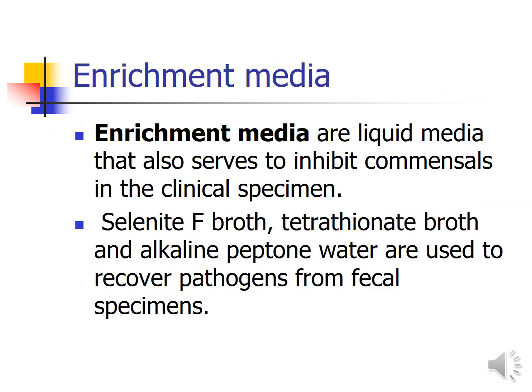Next is enrichment media. Enrichment media are liquid media that also serve to inhibit the commensals in the clinical specimen. Other examples are selenite, tetrathionate broth and alkaline peptone water, which can be used to recover pathogens from fecal specimens.